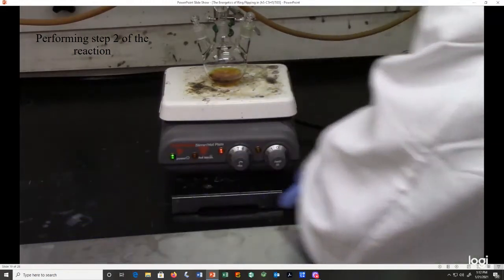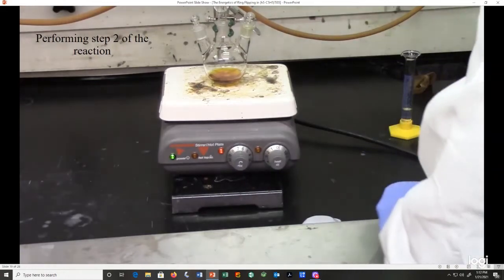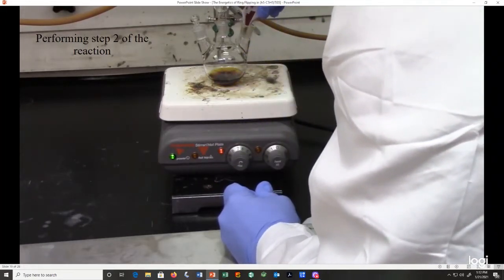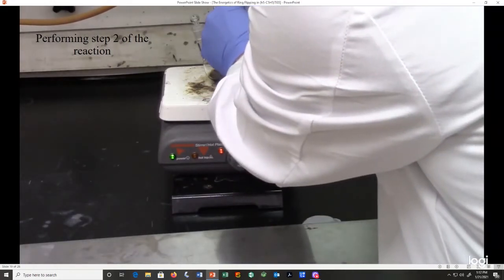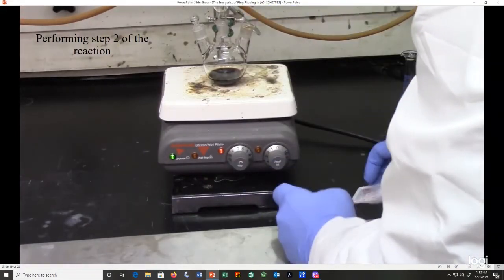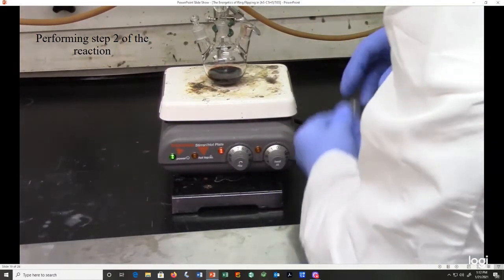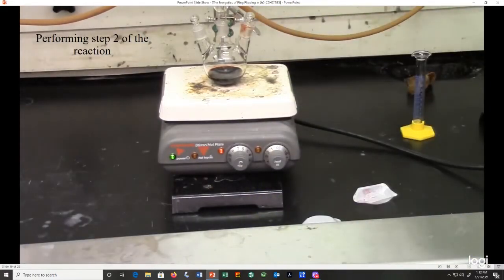Performing step 2 of the reaction. At this point, we're just going to add our titanocene dichloride, and then we're going to use another few milliliters of THF to make sure that we get everything down to the bottom of the reaction flask. So at this point, we can just let the reaction go for about an hour and a half.